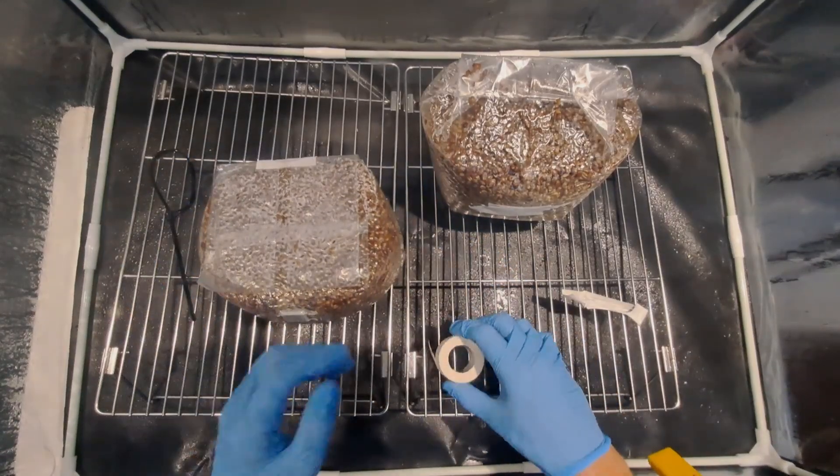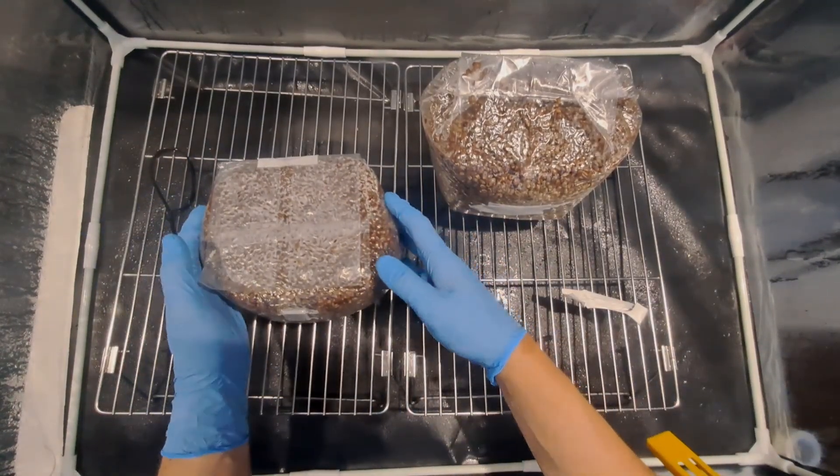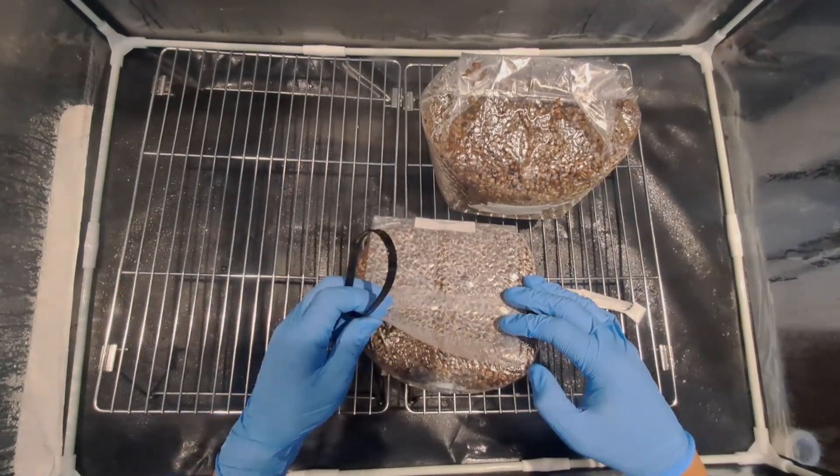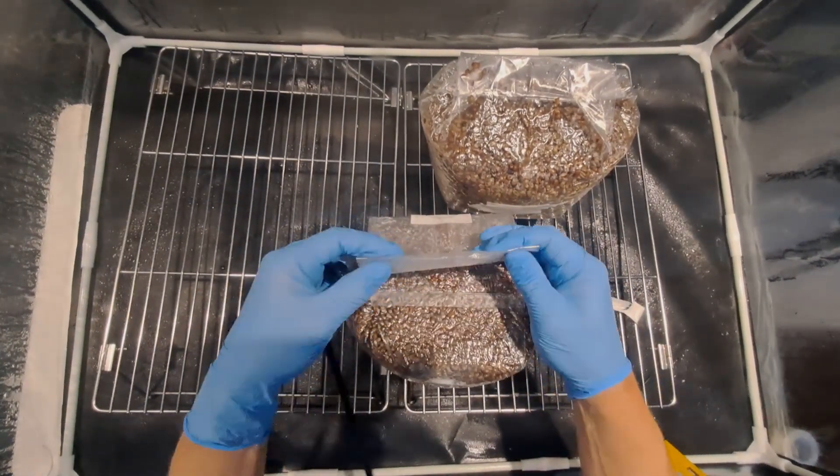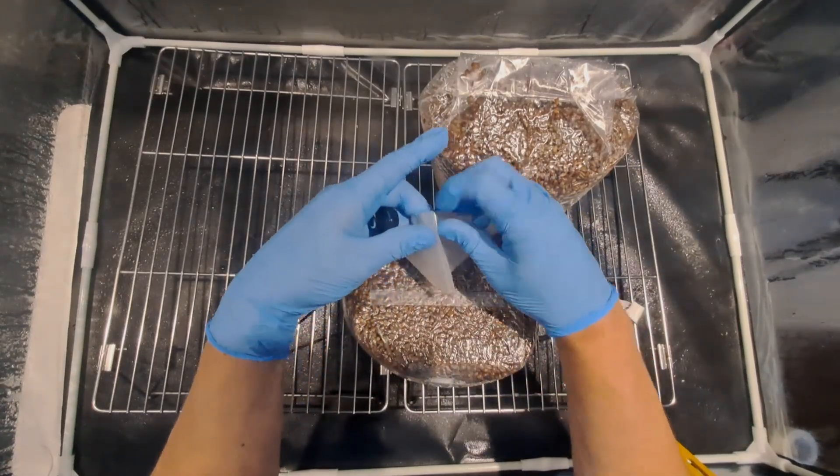Now that all of the inoculations are complete I'm going to seal the bags using a reusable zip tie. To do this I fold the bag down and then in half and then tighten the zip tie. This seals the top of the bag leaving no tiny spaces or anything.